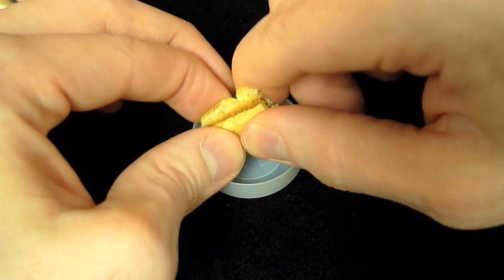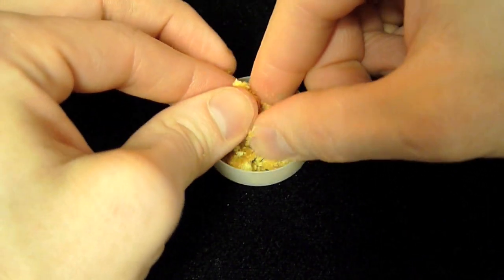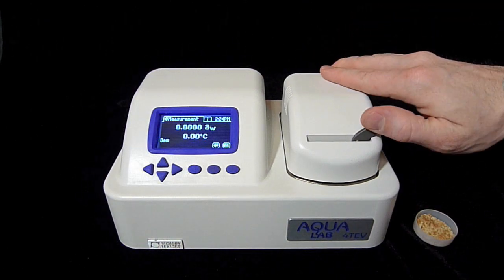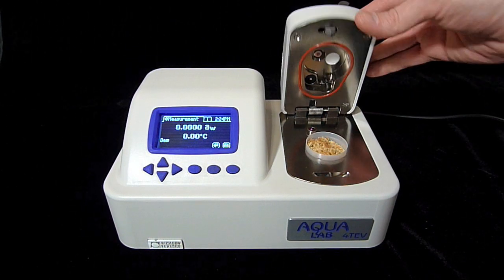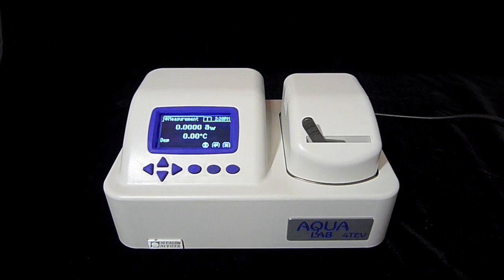Since I want to take a reading on this graham cracker-like product, I'll crumble it carefully into the sample cup, making sure that the bottom of the sample cup is completely covered and that the cup itself is not more than half full. Unlatch the sample chamber by pulling the chamber lock lever to the right. Holding the lever to the right, lift the chamber lid. You can see a number of sensors recessed underneath the lid. Be careful not to touch them or to leave the lid open longer than you need to. Set the sample in the chamber tray and close the lid by pushing down firmly. You'll feel a little resistance and hear a click when the chamber is closed. Lock the chamber by pushing the chamber lock lever to the left.